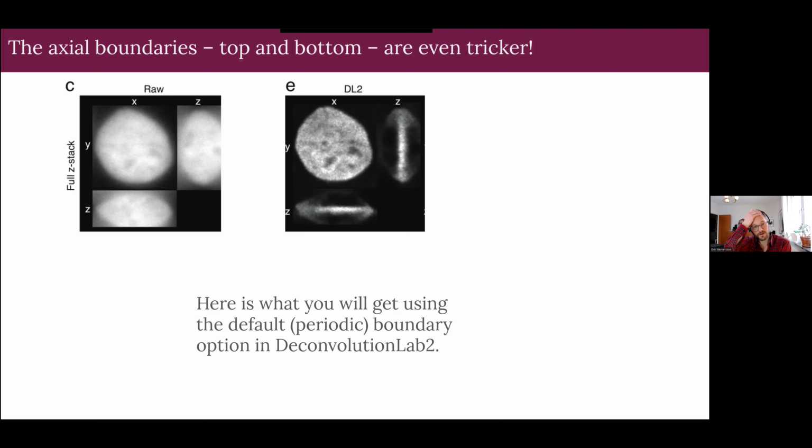Typically, the Richardson-Lucy algorithm doesn't really specify how you should do it. The standard way is to use some padding, and there are different techniques to do that. There are a few options in Deconvolution Lab 2. Another example I have is a full Z-stack, which is not padded. You see that the imaging started just on top of the nucleus and ended a little before you hit the bottom of the nucleus.